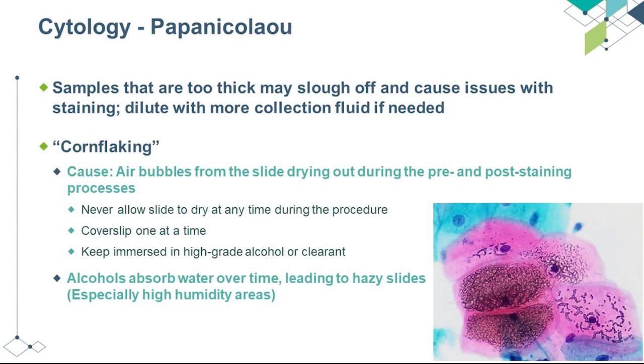I also wanted to quickly go over cytology staining and some issues that we see here specifically. As you may know, we are using the Papanicolaou stain here, which is a very complex and beautiful stain. However, there are some things that you want to look out for. Again, we see thick samples falling off as the main issue here.